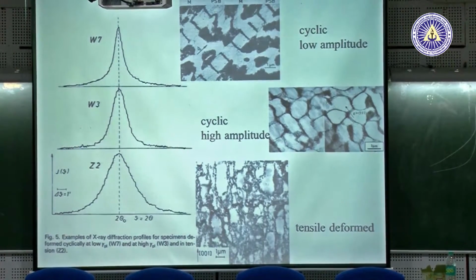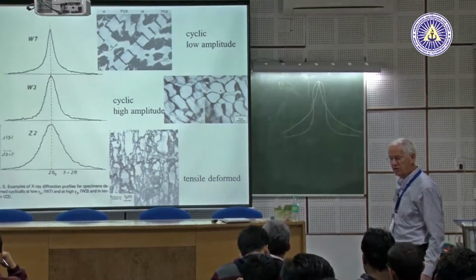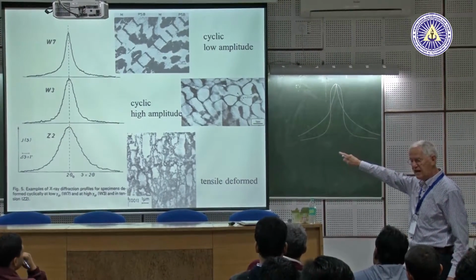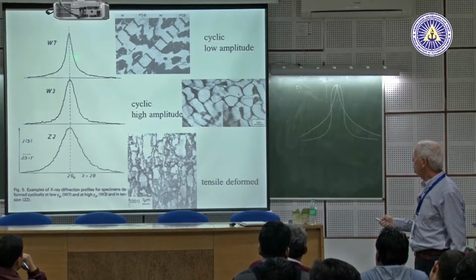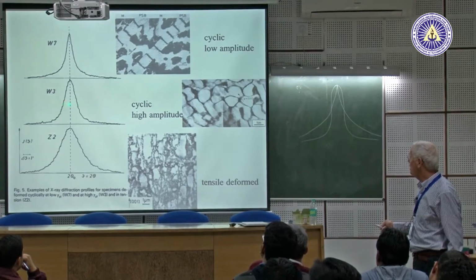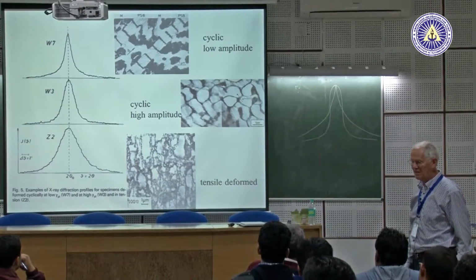So they are crossing each other at the full width half maximum. Okay? I don't know, can you see it now? That the upper one, if you would blow up that to the same full width half maximum as this one, then the tail would be definitely longer. Okay? This is the point.